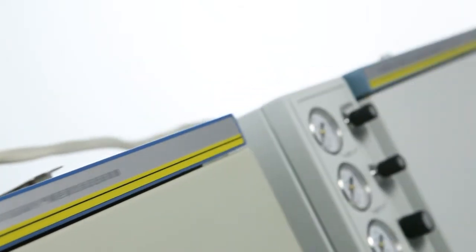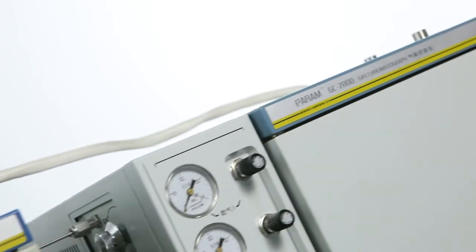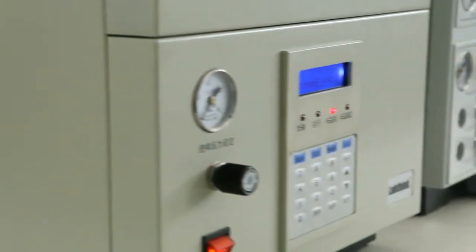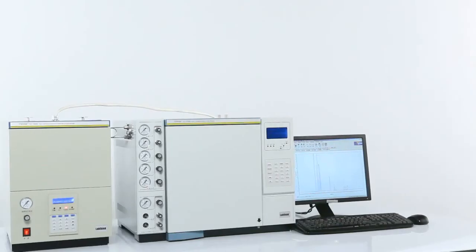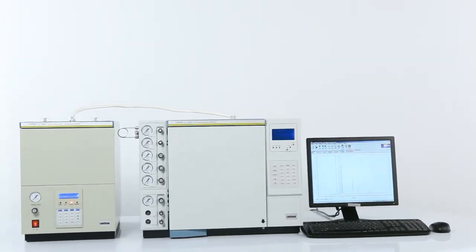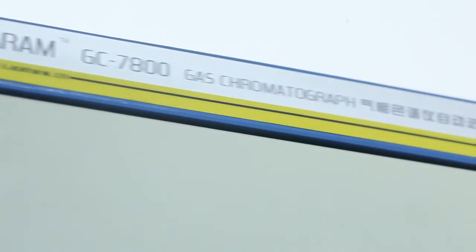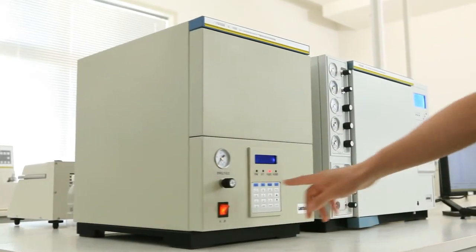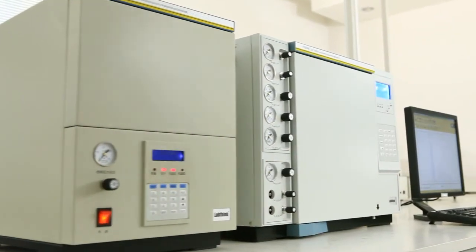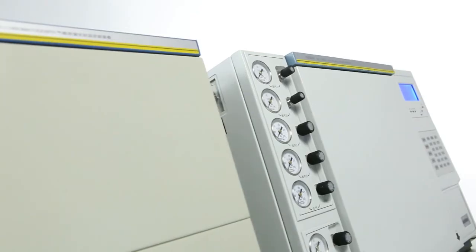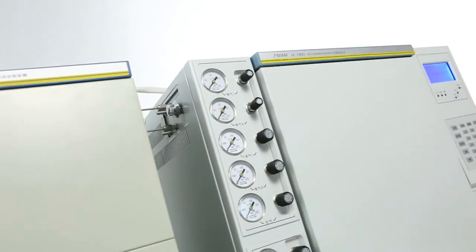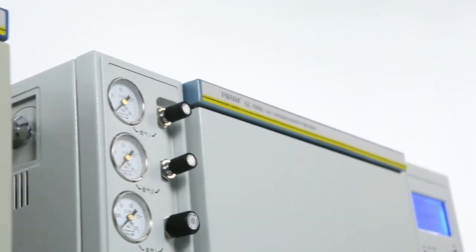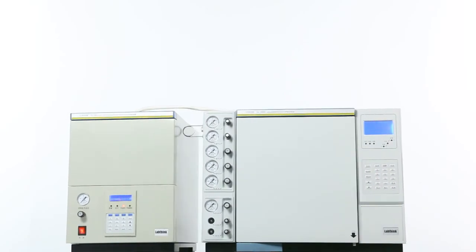The GC7800 automatic organic solvent residue analyzing system is widely used in the printing and packaging related fields and provides an excellent solution for testing services organizations, research institutions, packaging manufacturers, and food and pharmaceutical industries to conduct high-precision residue and purity analysis of organic solvents.